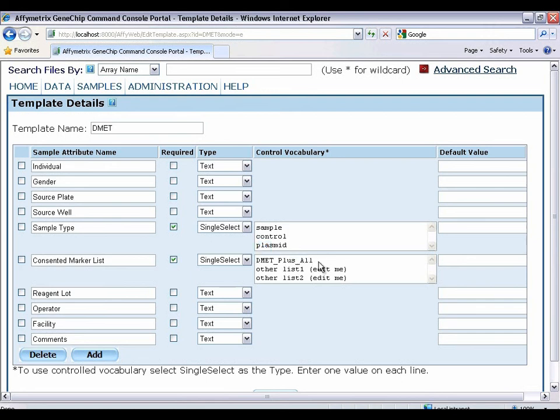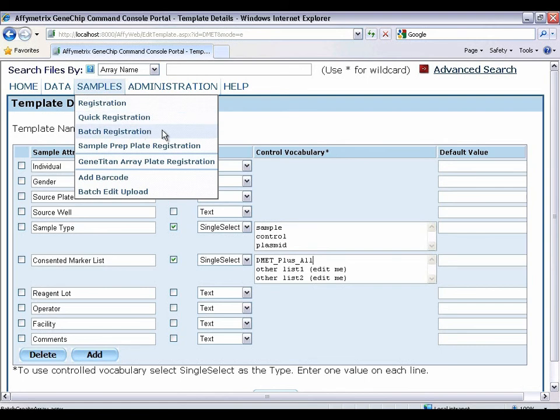Or if you want to process everything, select DMET plus all. To register your samples, let's do a batch registration.